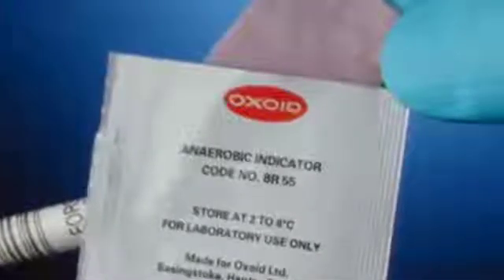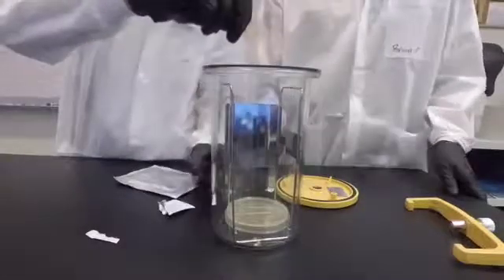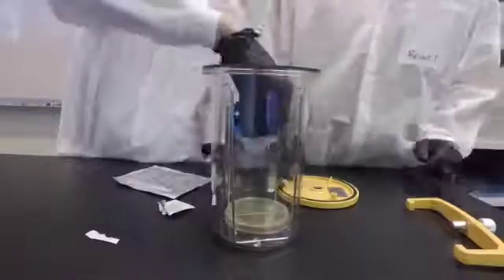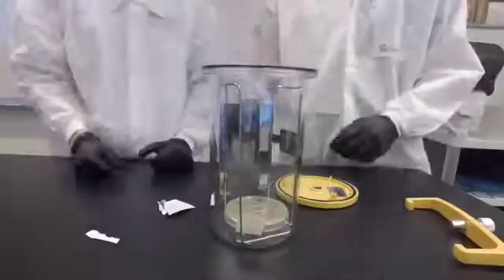As you know, resazurin is an indicator that is pink in the presence of oxygen, so when this indicator strip turns white, you will be assured that there is no oxygen left in the jar.